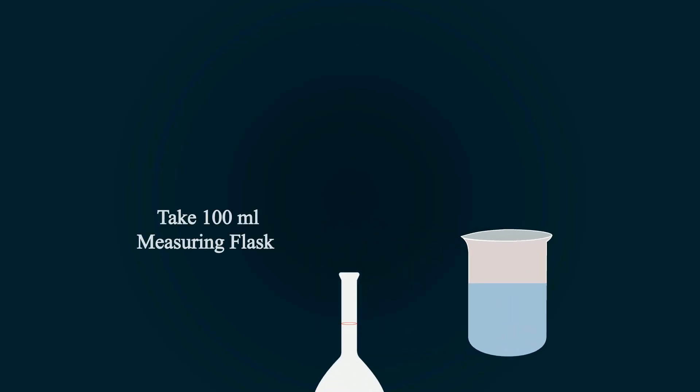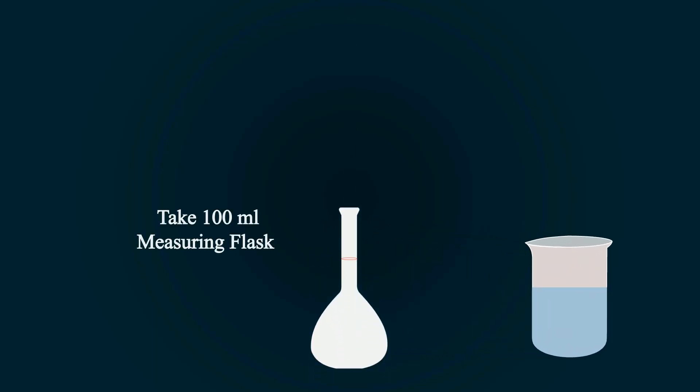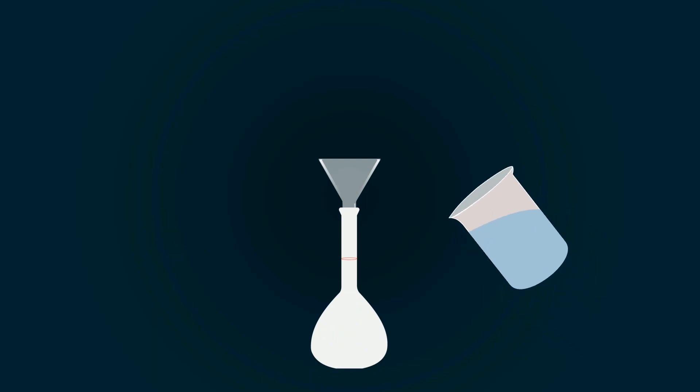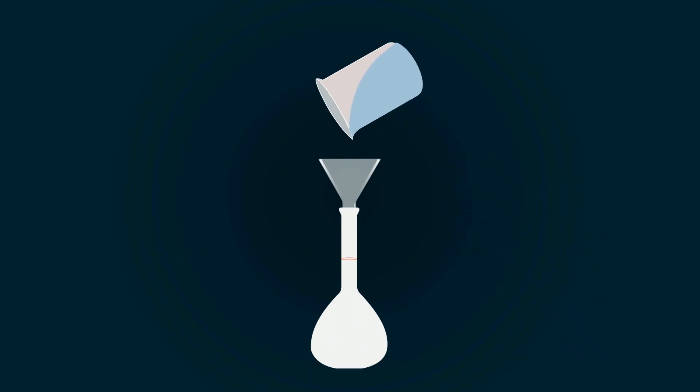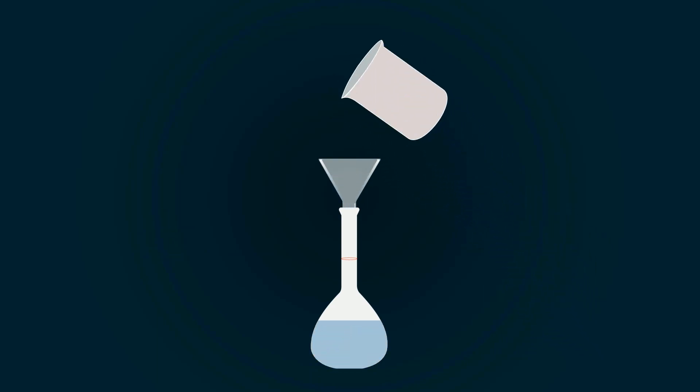Now take a volumetric flask of 100 milliliters and put funnel on the top of flask. Pour all the solution into the volumetric flask.